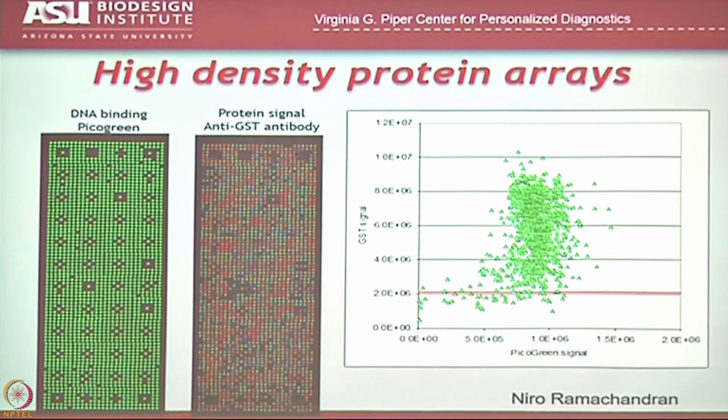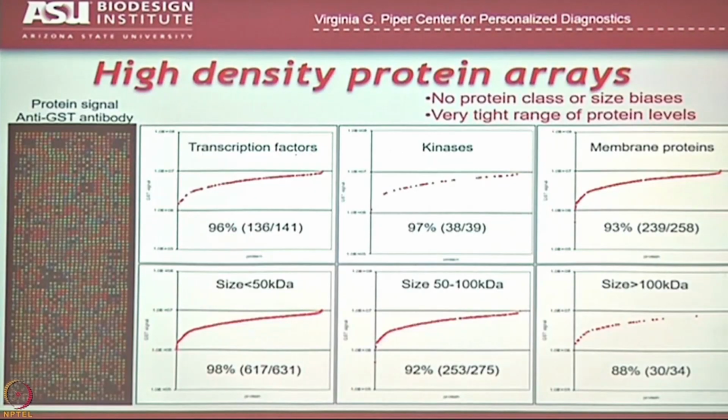And just to give you some better sense of that, here's quantification based on different types of proteins. Going from weakest to strongest, and then this line here represents the lower end of detection, and this is the higher end of detection. No, that's not true here. I'm sorry.